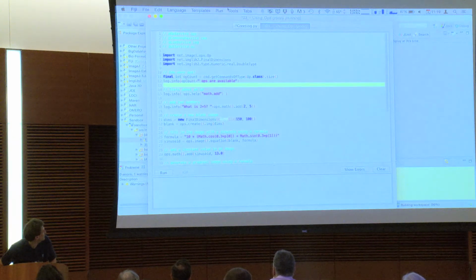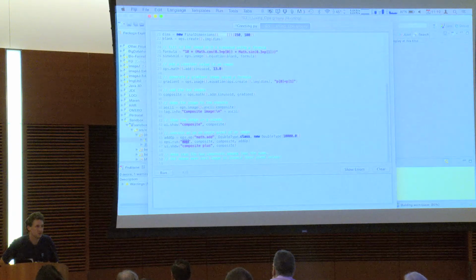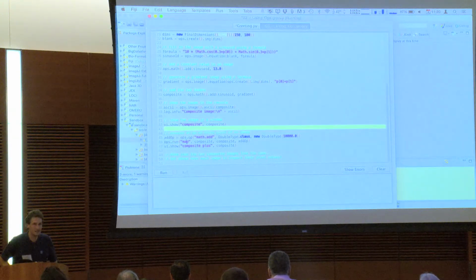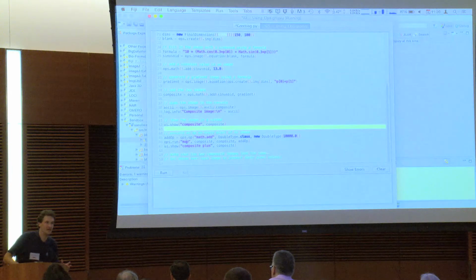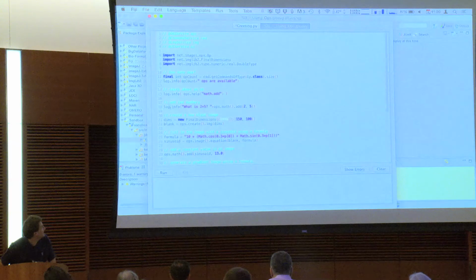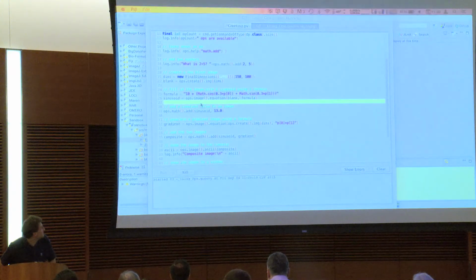The way that, well, I'll show you here. You have to say ops.run and then the name, and this name can be anything. So ops.run Curtis, but it's not built in the core. We can only make the core stuff really easy and then all the other stuff possible. That's the best you can do, right? In any case, I'm not going to belabor this example anymore, but you can look through it if you want. It shows off some of the things you can do with ops at a very basic level. This equation thing is sort of a toy, but it's just really fun for demoing.